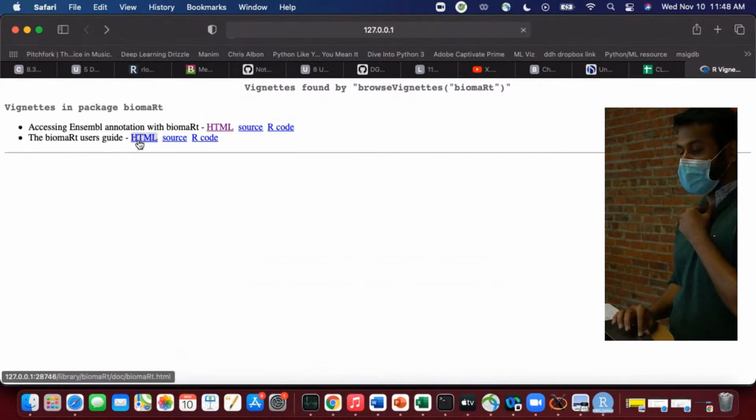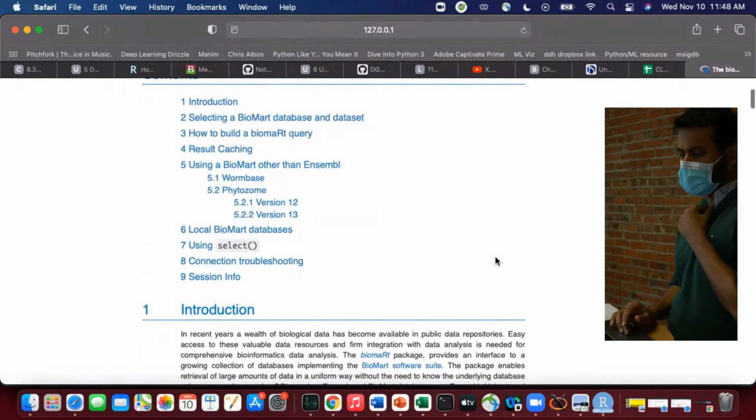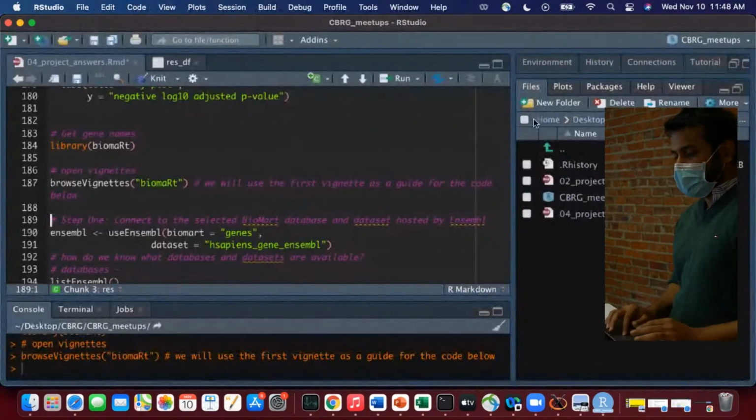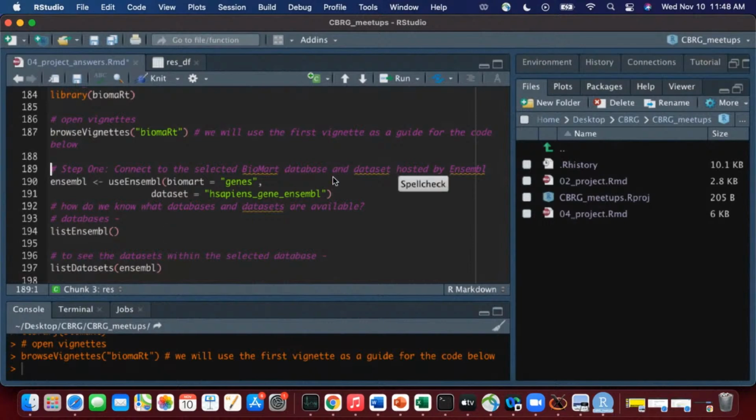And then, yeah, there's much more detail. Okay, I take that back. The first vignette's more detailed. All right. So there are a few. The kind of disadvantage, the negative aspect of using this new package, is just learning the vocabulary that comes along with it, but it's designed in a pretty nice way.